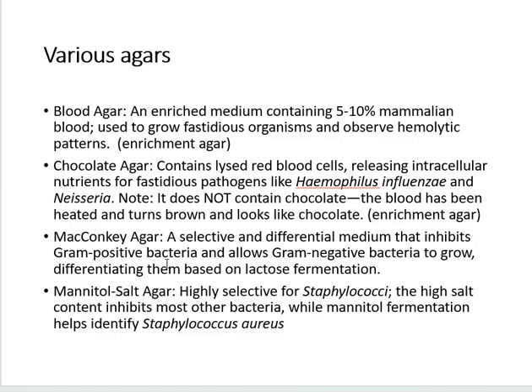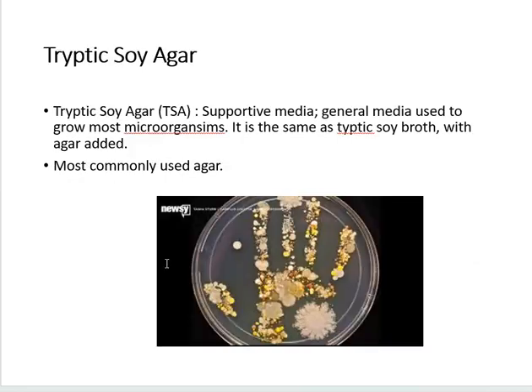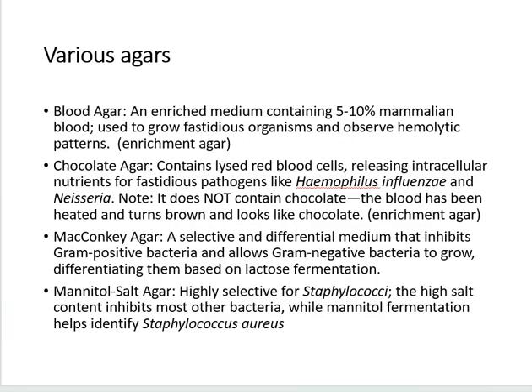Mannitol salt is highly selective for Staphylococcus. Very high salt content. It inhibits most other bacteria. And this helps us identify our lovely little Staph aureus, which is really pathogenic. Okay.